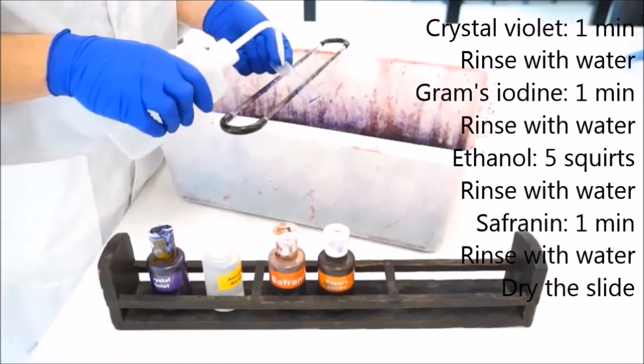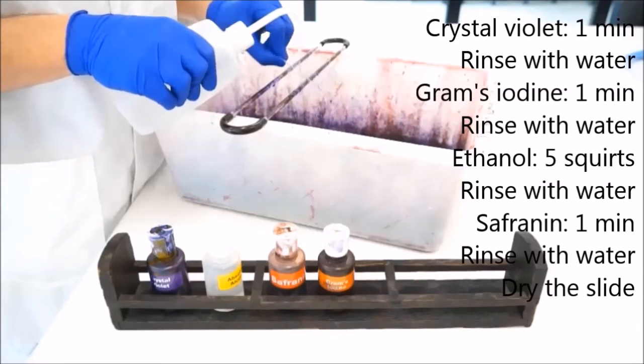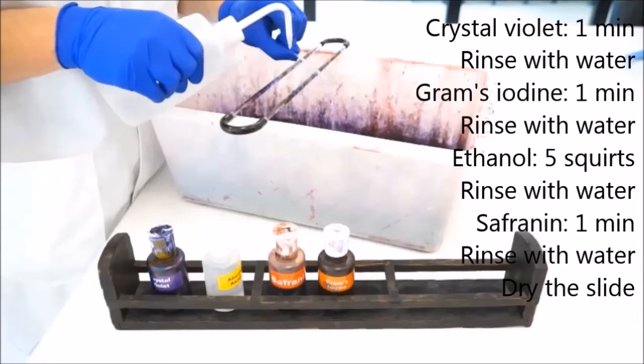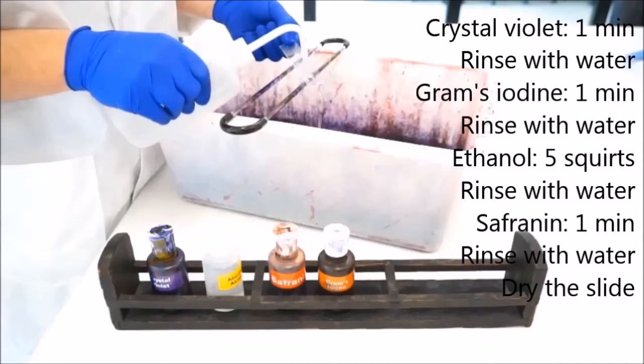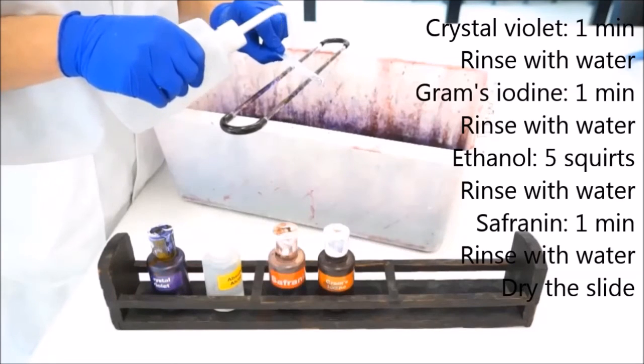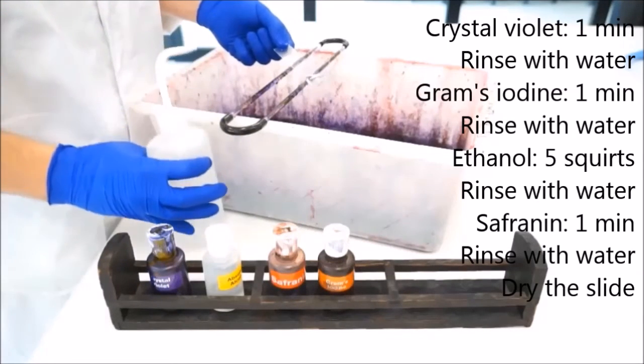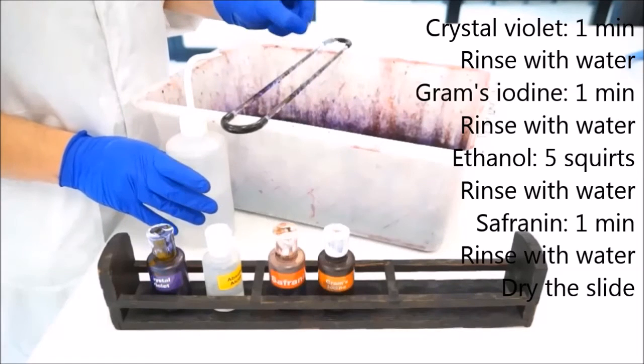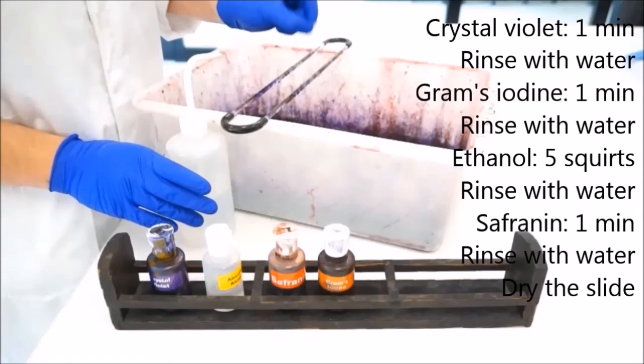Then immediately get some water on there to make sure that it doesn't decolorize too far. So that five squirts of ethanol is enough to be differential for the stain.